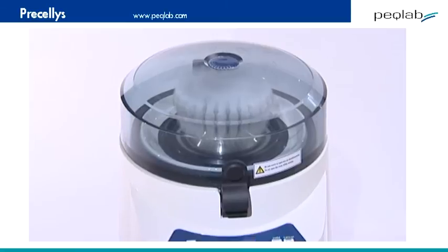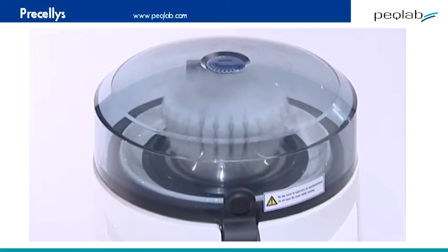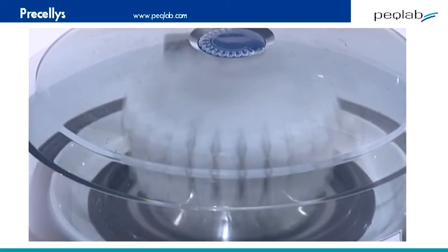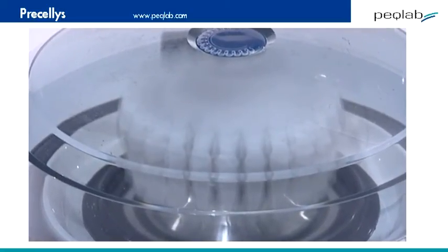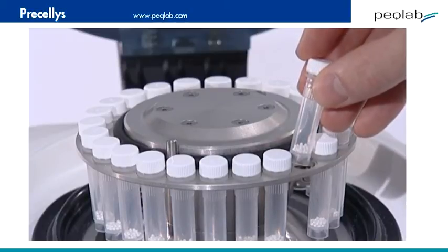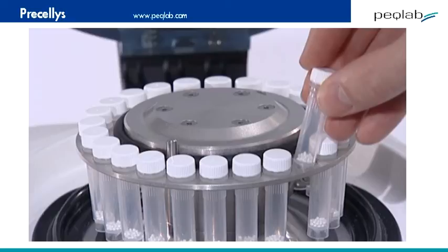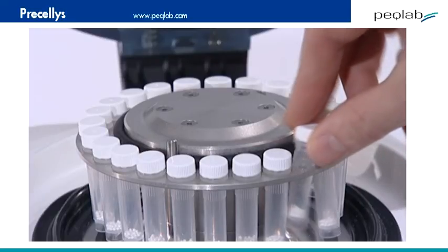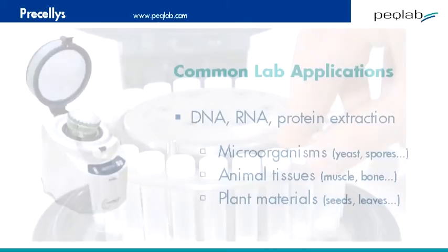Each tube is 2 ml in volume and is pre-filled with steel, ceramic, or glass beads to suit your application. In principle, the bigger steel or ceramic beads are used for tougher materials like seeds or grain, while glass beads are used for the disruption of microorganisms, bacteria, and fungi. Here at Peclab, we can provide full application support on this matter.